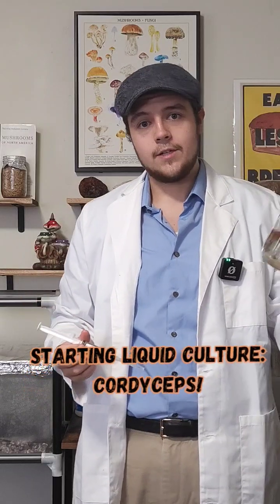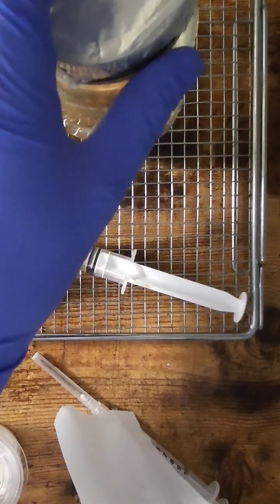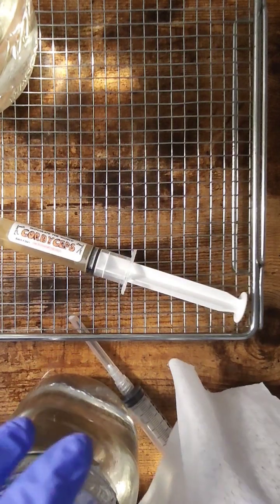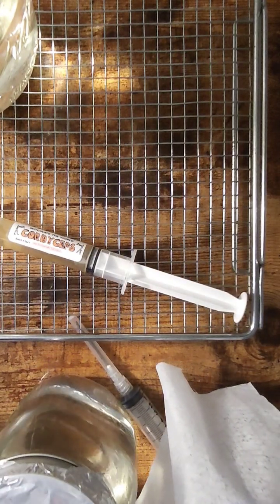Hi guys and welcome back to the Fungi Files. In today's video we're going to be injecting some cordyceps MSS, or multi-spore syringes, to liquid culture by inoculating some clean clear liquid culture with some cordyceps multi-spore.